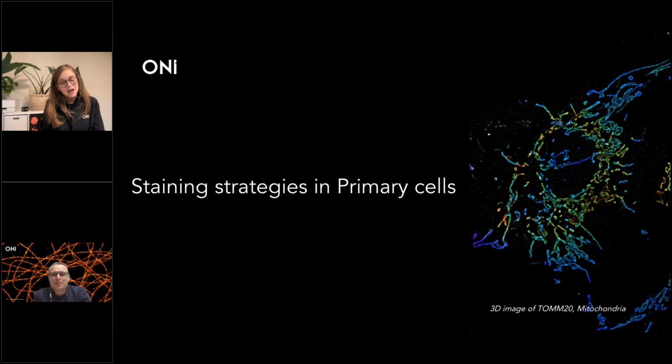So how do I make sure that if I get samples, maybe patient samples, that I nail my experiments and my sample doesn't go to waste? How can I prepare a really good primary cell sample? Yeah, so in this case, I would recommend first that if you are looking at any primary cells, try to figure out whether there is a cell line which corresponds to the same. For example, as I mentioned, T cells have a Jurkat T cell line or other T cell lines. As target cells, you can use macrophages, you have THP1 cells.